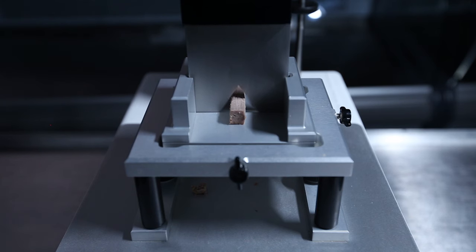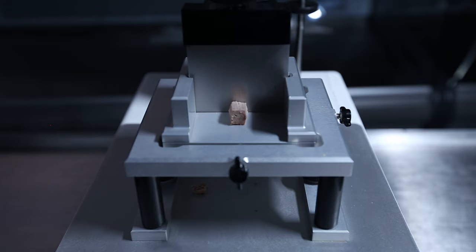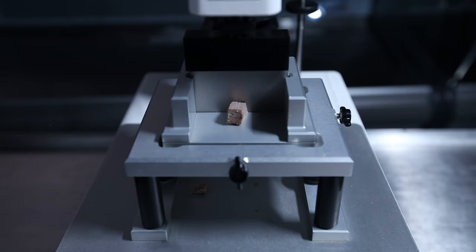There are different types of blades which can be used. The Warner Bratzler replicates the jaw by producing a shear cut.